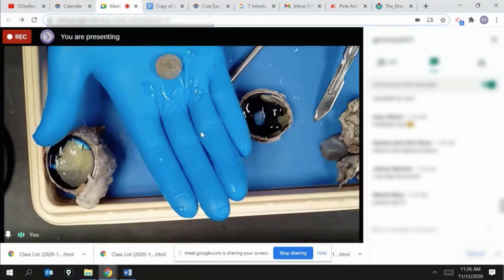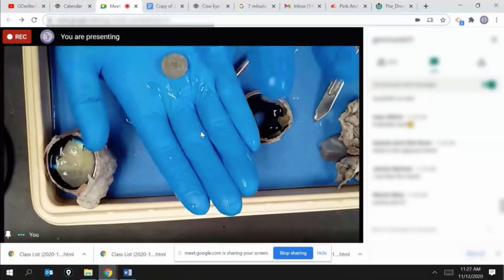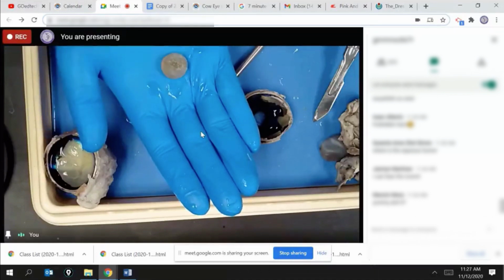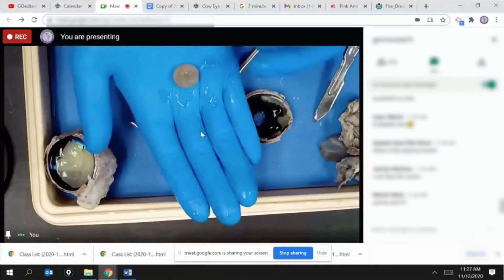The other thing I want to point out to you is this vitreous humor, because it's in there and gives the eye its shape. It keeps the retina kind of in place, flush on the back of the eye. If it's wrinkled, if there's any kind of folding, then it can cause issues with vision. Okay, I'm trying to get that to the right place there.